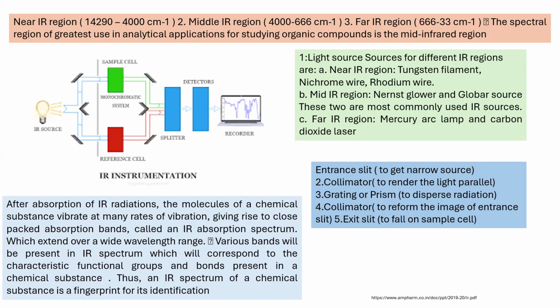Right. Now, as for any other spectroscopic method, whatever light is generated by the light source, the entire volume need not be allowed to enter the sample. So you are going to select the quantity of the photons or the light energy. So you have the entrance slit. We have talked about it in yesterday's lecture in detail. Entrance slit, exit slit, the pore or the diameter of the slit, the width of the slit, all these things are very crucial to get correct analysis using spectrophotometers.